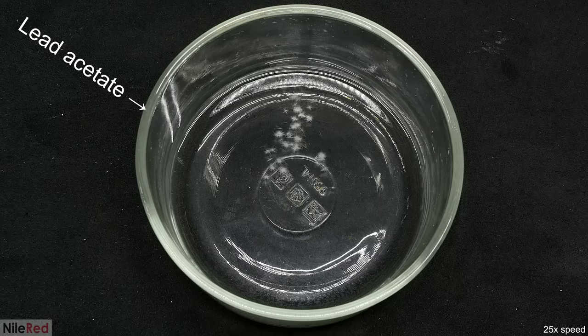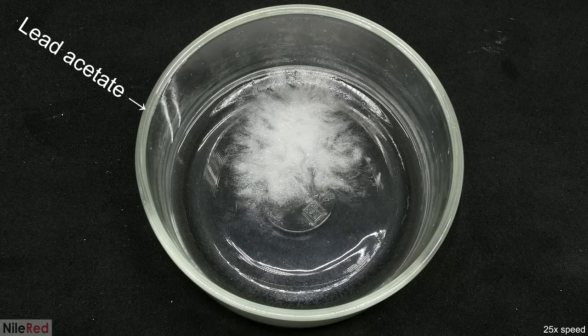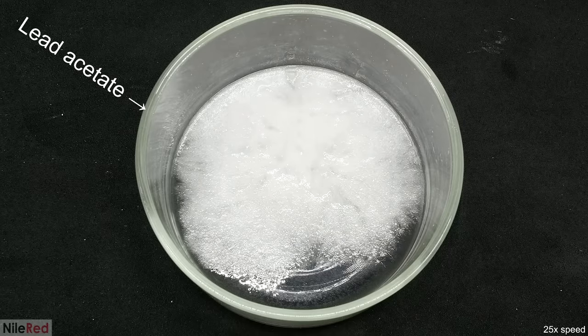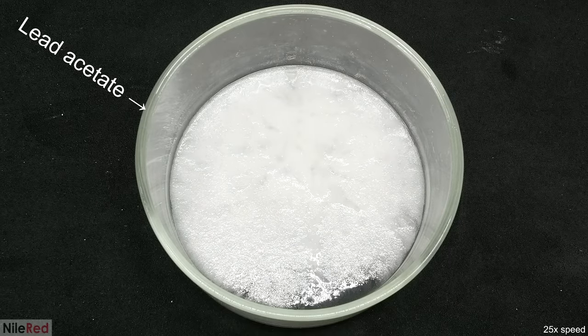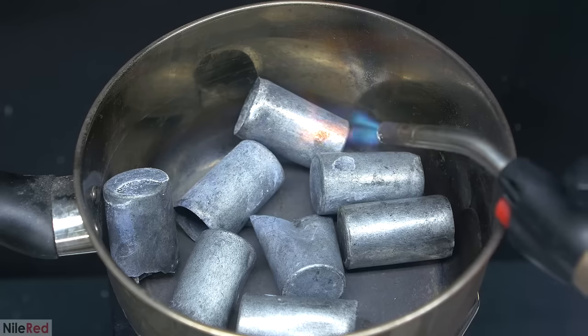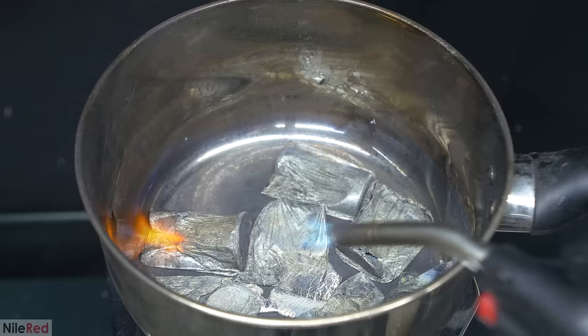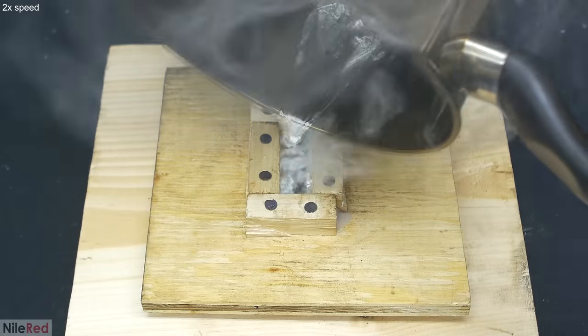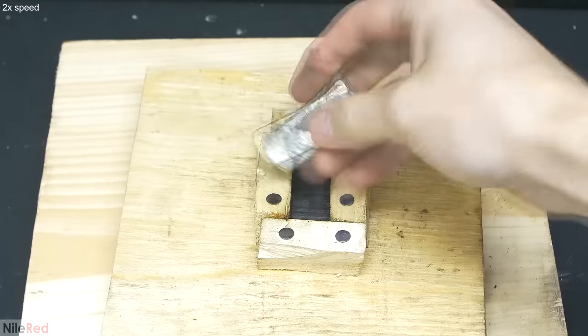To try this out for myself, I only needed two things: a soluble lead salt and a source of zinc. The lead salt I used was lead acetate, which I made a whole bunch of in my sugar of lead video. The zinc comes from an even older video where I melted down the shells of several batteries and cast it into a solid block. At the time there was no real reason to do this and it was mostly just for fun, but I guess I finally found a use.